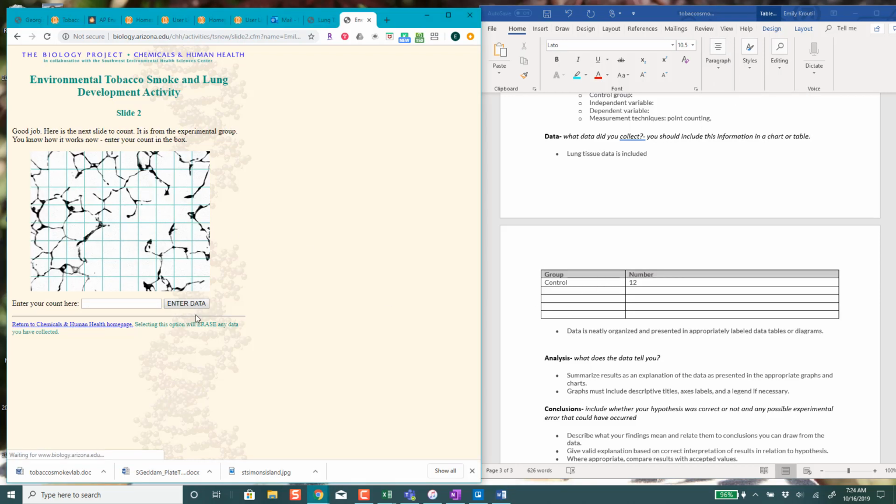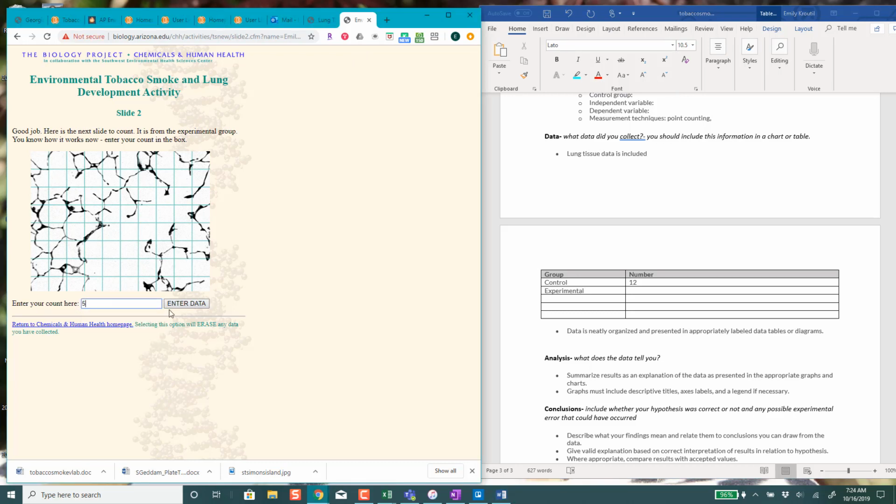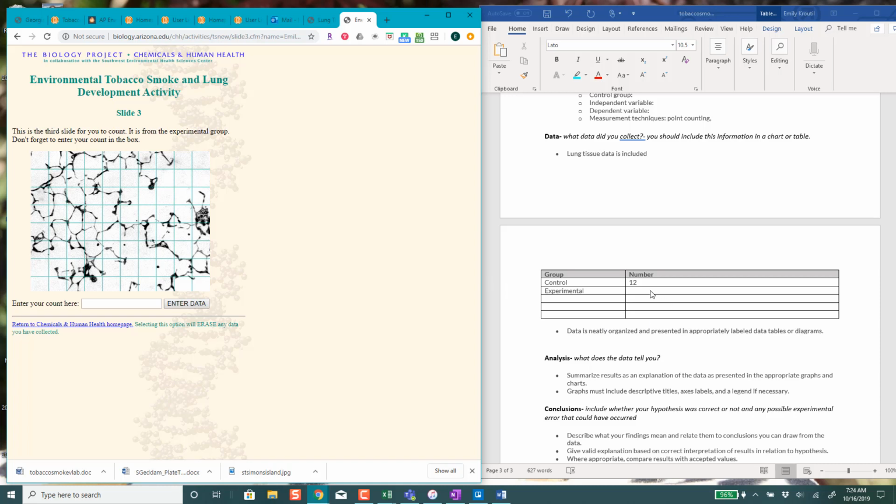Okay, so this is from the experimental group. Okay, so again, we're kind of checking. I can already see that this one is less than the other one, right? Let's just put, like, I don't know, 5. Okay. Experimental.